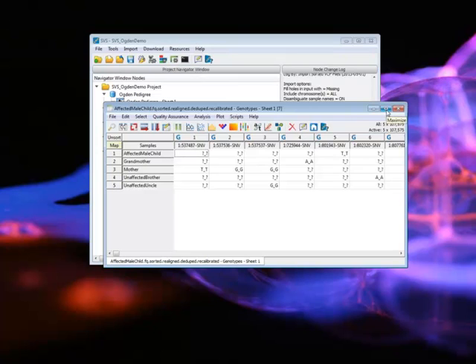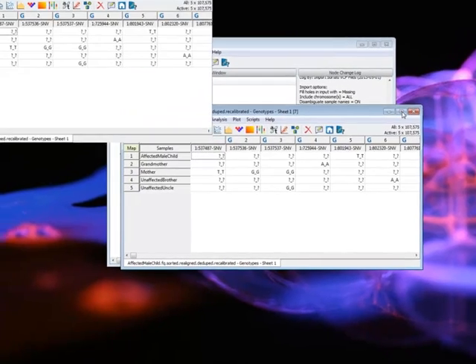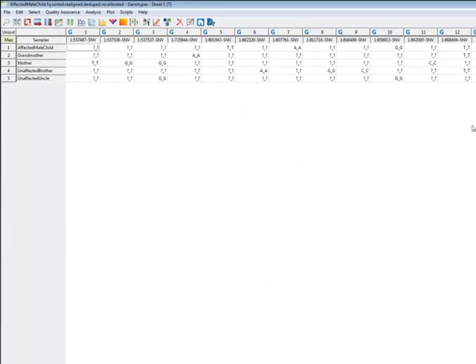It's strange. I think VCF was originally intended to be machine readable, but it's mutated over time to be more human readable or Excel readable. And it makes it difficult to process sometimes with other functions.